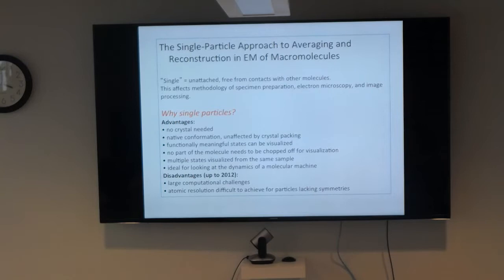Crystal packing sometimes, or very often, just focuses on one particular conformation, which minimizes the energy of the whole formation of molecules, of the whole crystal. And that conformation of the molecule is not necessarily functionally relevant. So it gives you a wonderful, high resolution structure, but this particular conformation in which the molecule resides might not have anything to do with the functional structure.